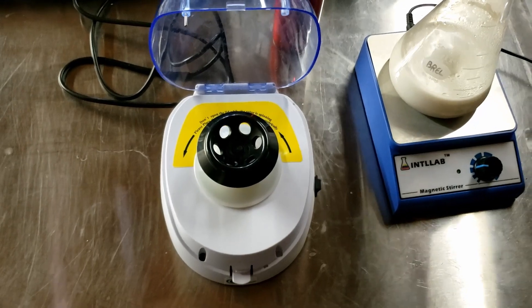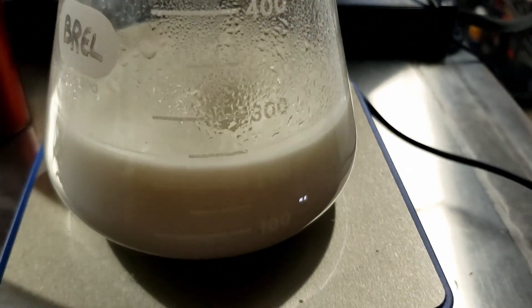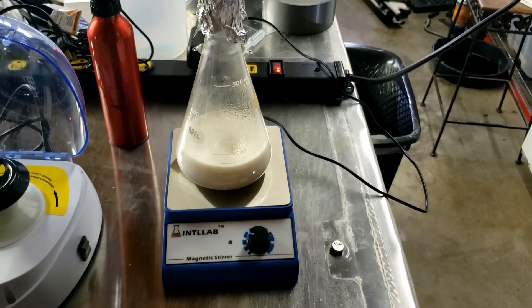The procedure for preparing the lactase enzyme is really simple — it requires about a hundred dollars in supplies if you don't already have them, and you need a pipette and a centrifuge. The centrifuge was only about $30–$40 from Amazon. First, I grew Kluyveromyces lactis on milk — I wanted to grow it with lactose present so the lactase gene is turned on, since the cell won't express genes it doesn't need.